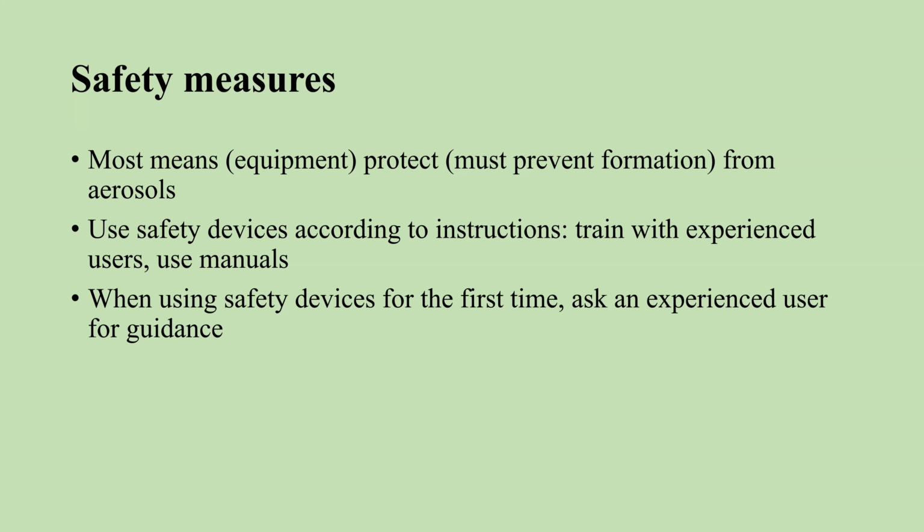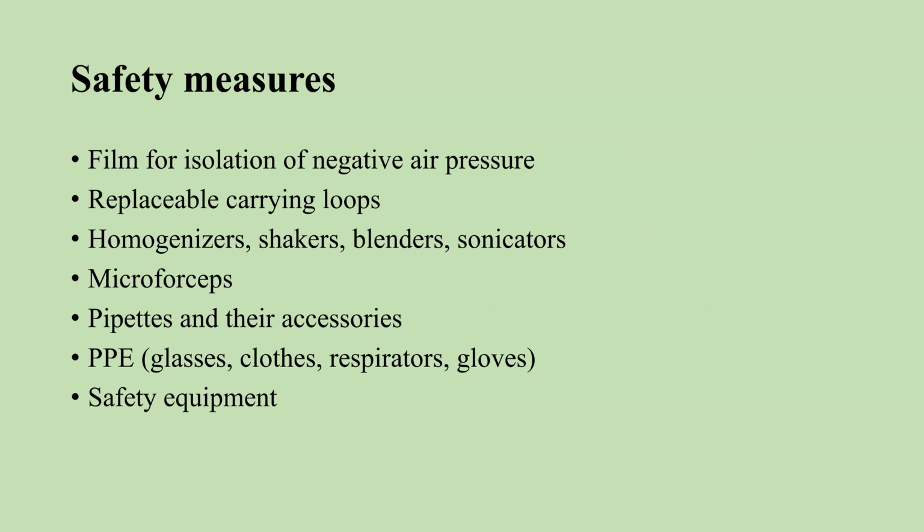Another demand is protection from aerosols: use personal protective equipment and a hood, etc. All lab equipment should be isolated from negative influence and not contaminated. And there is a list of what we should use in this lab.